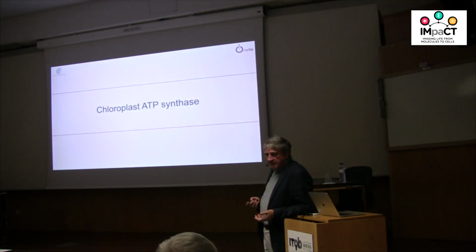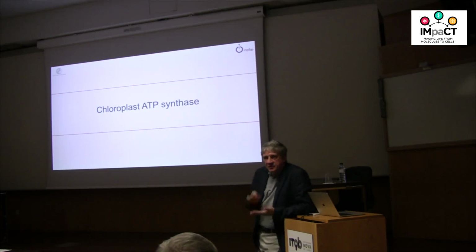Yes? Can't you just change the grids? Use more grids? Well, we only record one image of each particle. So the grid doesn't really help, because you only get one image. So on the same grid, another grid makes no difference. It's just a single image of each particle, but it's 40 frames, which are then added up.